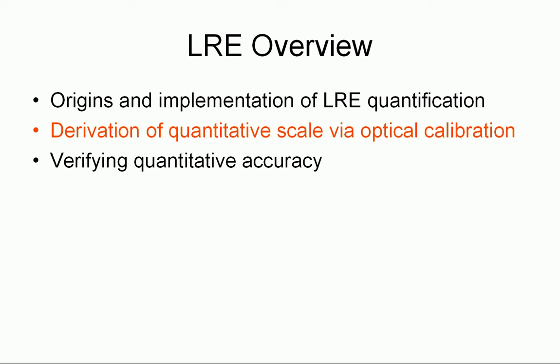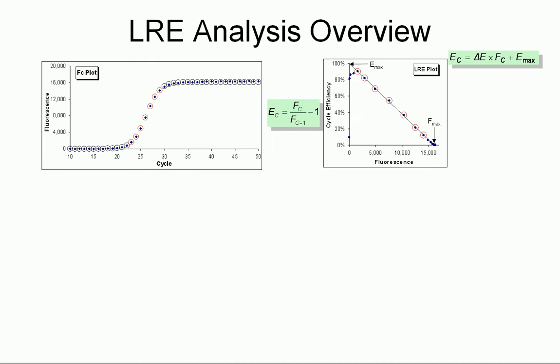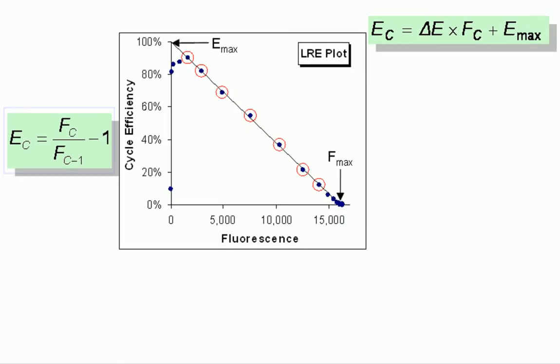In this second presentation, I will introduce the concept of optical calibration, in which the fluorescence intensity of an assay is quantified. Let me start with a short overview of LRE analysis. LRE originated from analyzing the kinetics of PCR amplification. This is done by plotting cycle efficiency against reaction fluorescence.